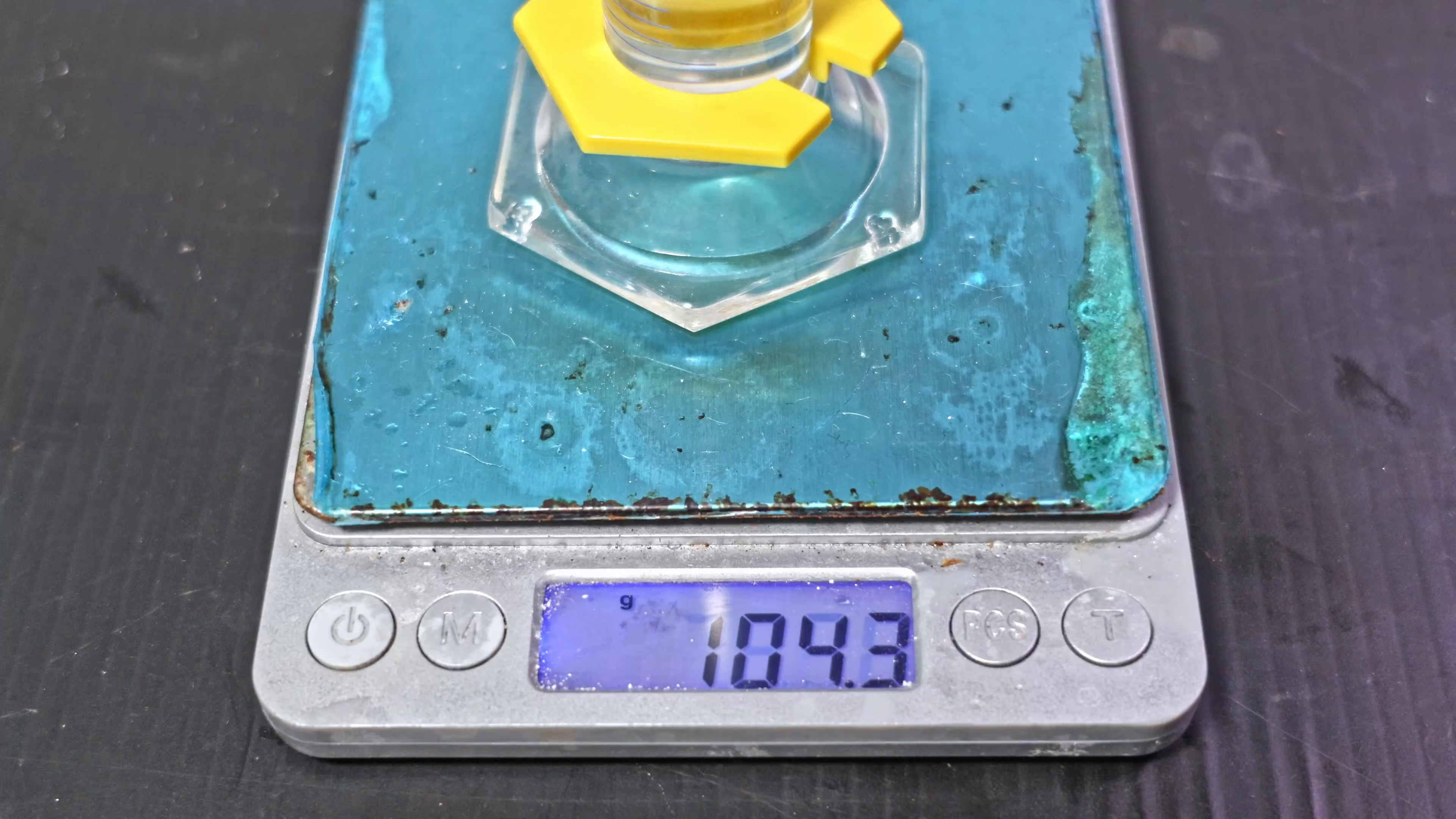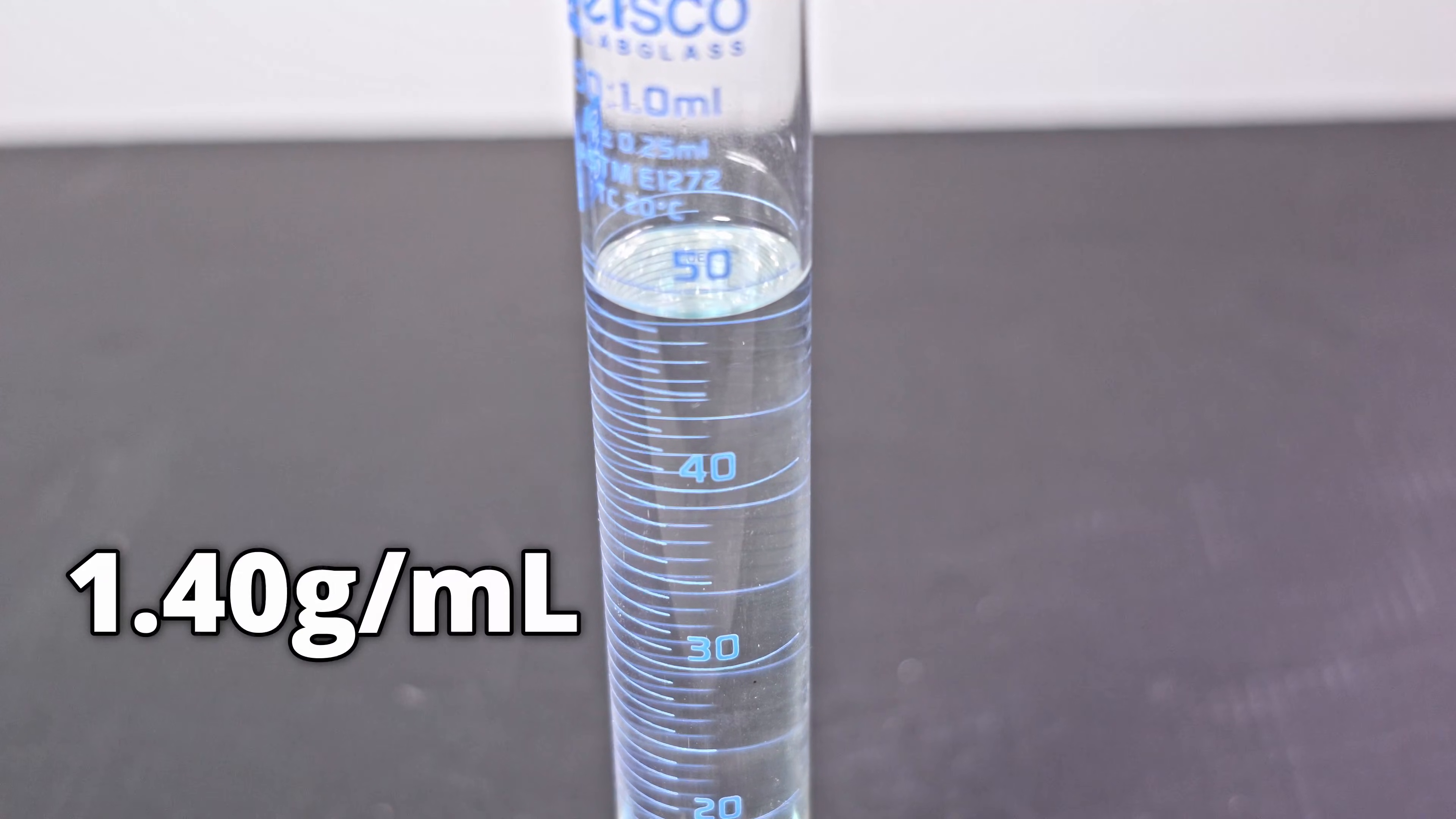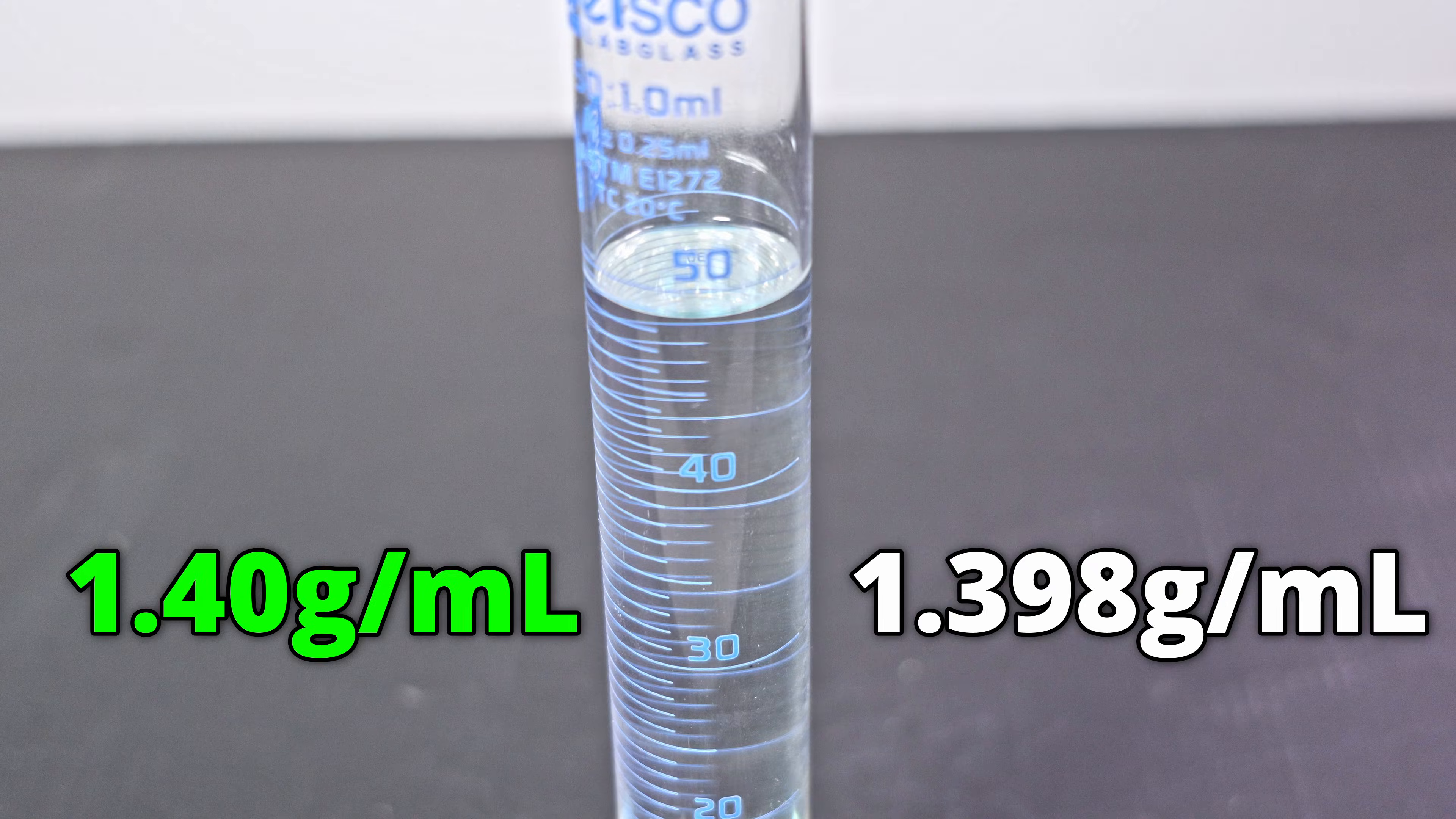For my density test, I weighed 67.5 grams of allyl bromide. The volume is a bit over 48 milliliters, making the density 1.4 grams per milliliter. That is perfectly in line with allyl bromide's reported density at 1.398 grams per milliliter, definitively proving I have made pure allyl bromide.